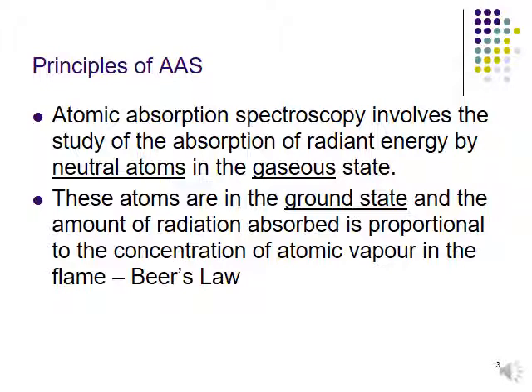These atoms are in the ground state. So basically, all of the analytes are in the ground state, and it is not a radical state. It's already in the ground state, and the molecules are in a stable condition.